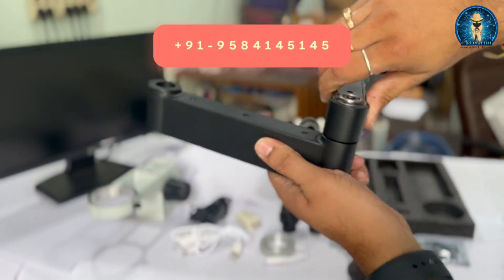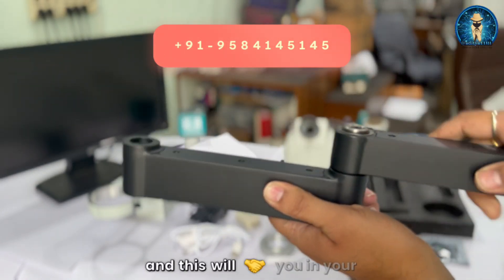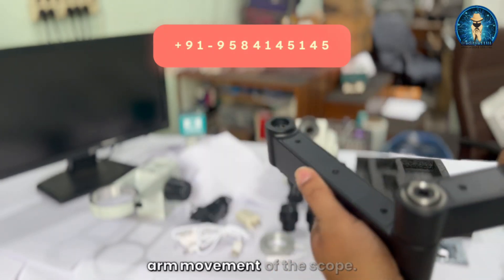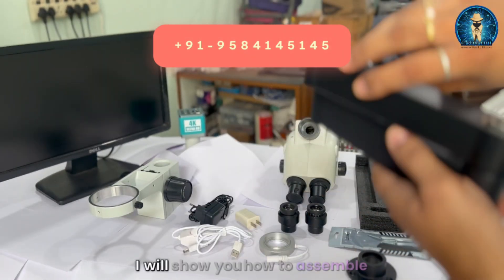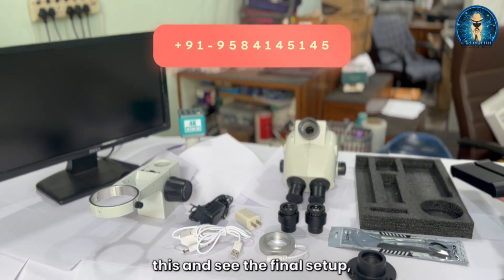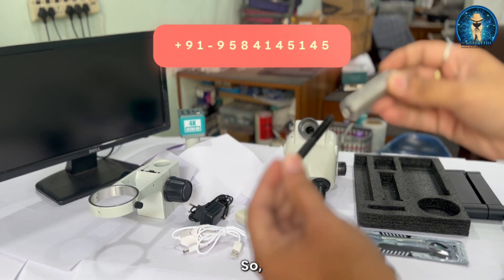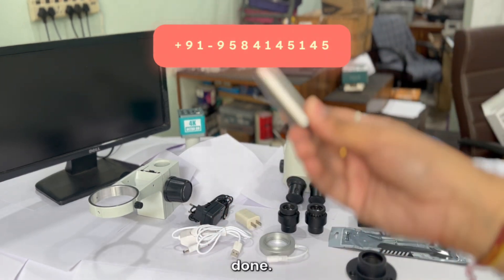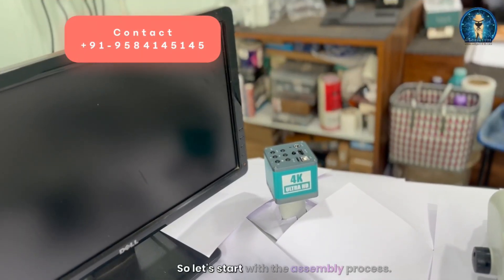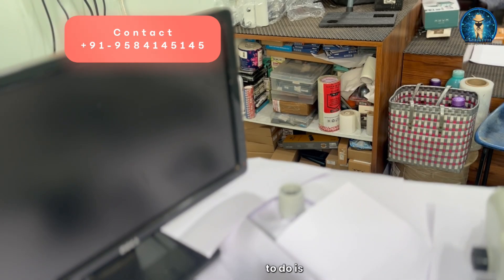This part will give you 360-degree movement and will help you with the arm movement of the scope. There is also a knob that is part of the stand holder. We will assemble everything and see how the final setup looks. Let's start with the assembly process.